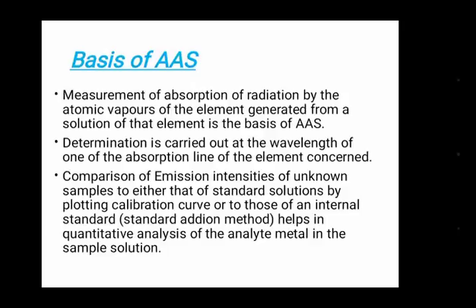Comparison of the intensity of the unknown sample to either that of a standard solution by plotting a calibration curve, or to those of an internal standardization method, helps in quantitative analysis of the analyte metal in the sample solution.